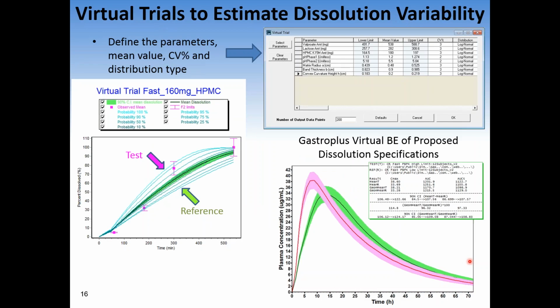Once you have that dissolution profile and your IVIVC, so once you know the relationship between your in vitro dissolution test and your plasma concentration profile using the GastroPlus model and IVIVC, there are some more powerful features that you can look at, sort of the variability in your dissolution test. So you can simulate dissolution variability by doing a population simulation within DDDPlus, basically adding variability to the content uniformity of the tablet and some of the parameters in the dissolution experiment. And then you can simulate a family of curves.